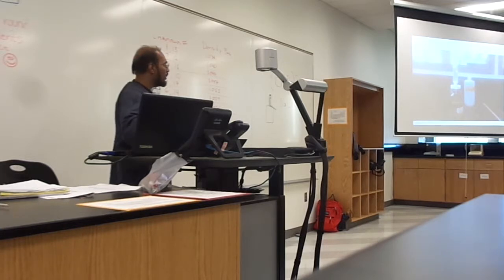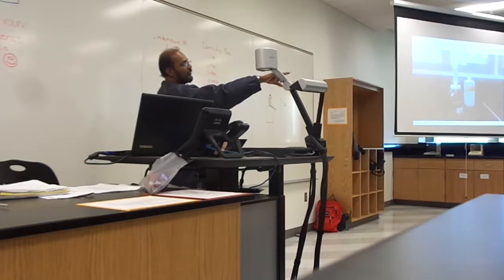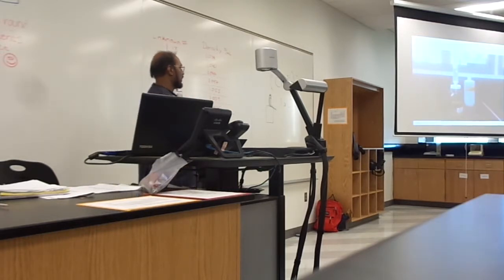It's already calibrated to 5 milliliters. The one with the gray is actually potassium iodide, and you use that one. Don't change the settings and transfer 5 milliliters directly to your beaker. You just pull it up and then push it down and measure approximately 5 milliliters. It doesn't have to be exact because here we are using it in excess.